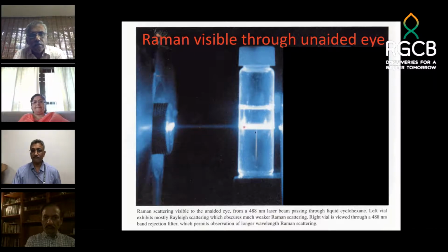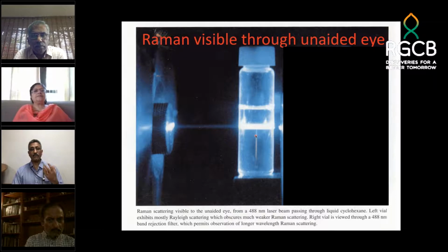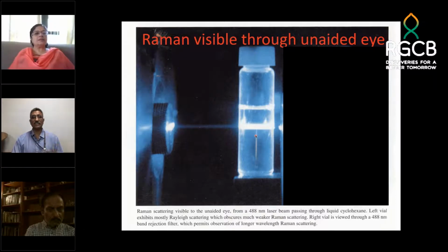Now most of you would be confused, why does it look white in color? But all of you know that if I take a photograph when there is bright light, then I would saturate my detector, and my detector cannot distinguish colors. And this is what you have seen when you take a photograph in bright sunlight. You can't see colors very well because the brightness of the light is so much that it saturates your lens. Nowadays, cameras come with an adjustment of the pupil so that you can avoid saturating the detector. But here the light intensity is so much that it is giving you a white color.